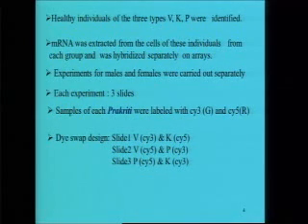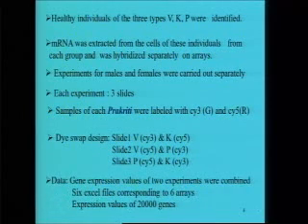But again, one experiment consisting of three slides gives us only two observations from the vata prakriti group, two from kapha and two from pitta. So it was decided that the data on two experiments will be combined. So we combined the gene expression values of these two experiments. Eventually we had six files corresponding to six arrays. And then after deleting some spots where the hybridization was not properly carried out, we had data on about 20,000 genes. So let's see how this data is analyzed, and we arrive at a set of genes which have a different profile in these three prakrutis.